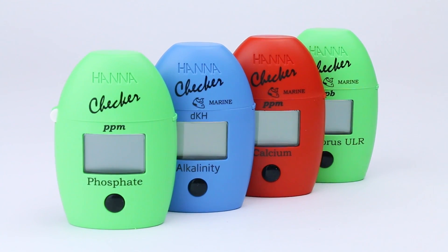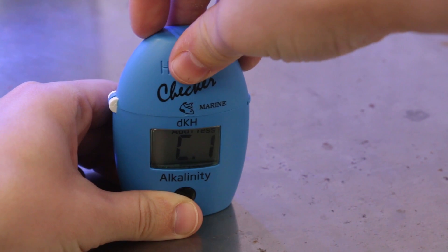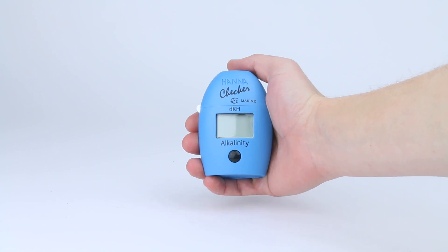Hanna Instruments' Checker Colorimeters are a very popular choice for water testing at home because they can eliminate some of the human error and discrepancies that come along with titration and color comparison type test kits. They are small, quick, and convenient.